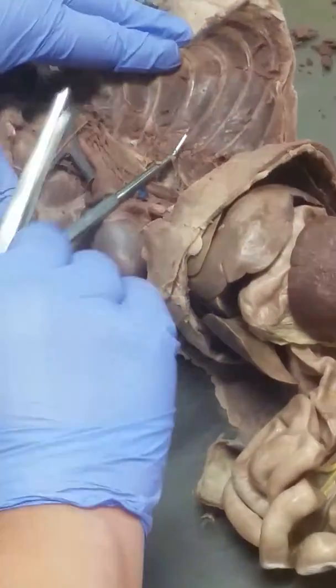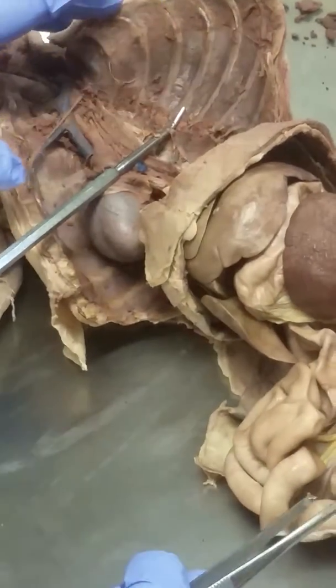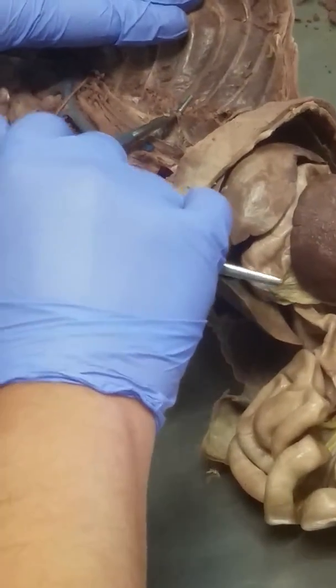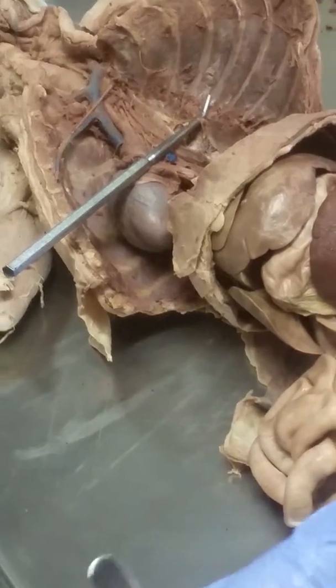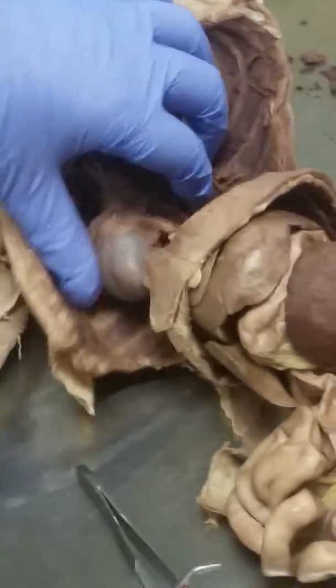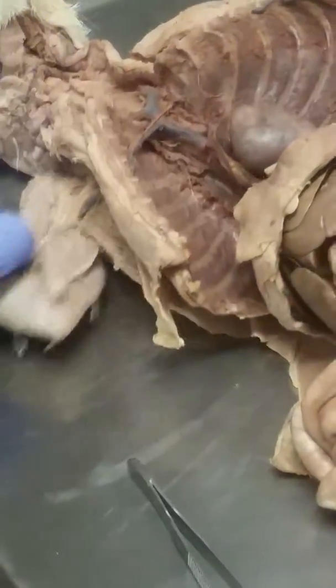Okay. When you try to lift it up, you'll feel some resistance. So if you lift it up carefully, you'll hear some snapping. What you're breaking off is just the little communicating rami, right? That go on both sides. Okay. Now, there's another structure here in the thoracic cavity that you want to pay attention to, and that is this structure.